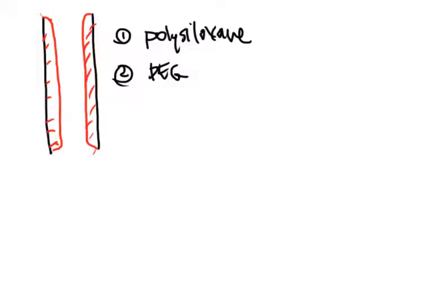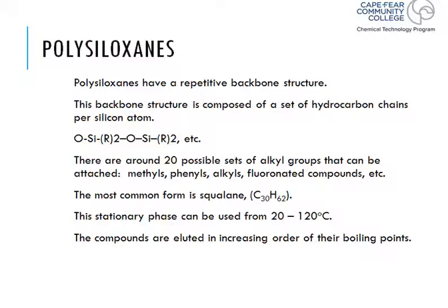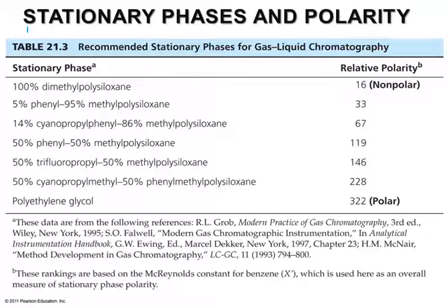And then once these go on, we can modify these stationary phases, and we can put things onto the stationary phase that will help us separate things a little bit better. And we said that there was a variety pack of these things. There were tons of different choices that go onto these polysiloxanes or PEGs that allow us to separate things based on functional group or based on boiling point or based on polarity or based on structure. Whatever the case is, that will help us do our job a little bit better. Okay? So we said that there were plenty of choices, and here are some of those choices that we might see.